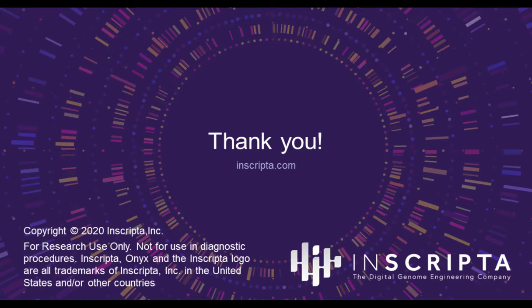Dr. Klitten, how will your method support hit validation if I want to reconstruct edits which have shown to be enriched in pool cultivation experiments? Yes, I talked about that a little bit. If you have found a number like 100 hits or so, you can create a small library on the Onyx in order to reconfirm this and just do sequencing of those fewer different designs.